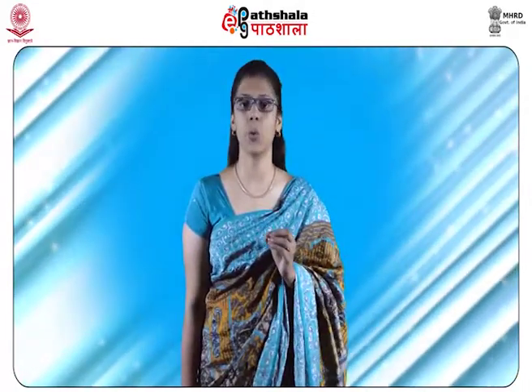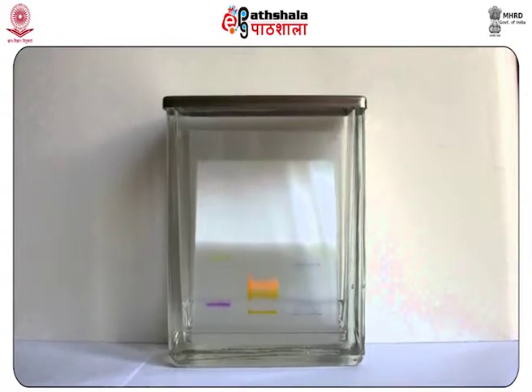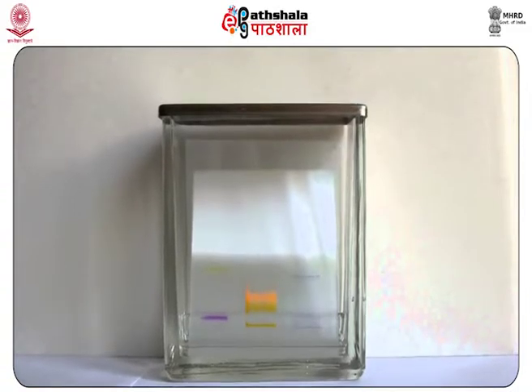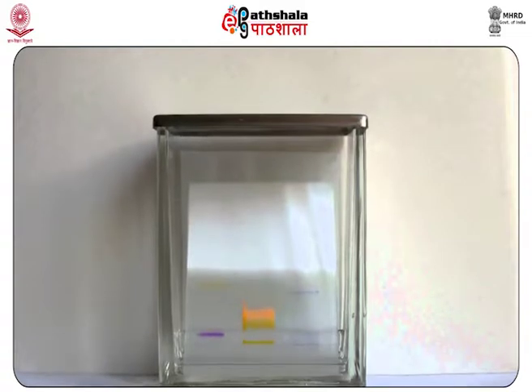It is suggested that the question sample, control sample and standard dye are run at the same time. As the plate is completely dry, it is kept in a covered chamber containing a pool of eluent. This can be as simple as a beaker covered with a petri dish.